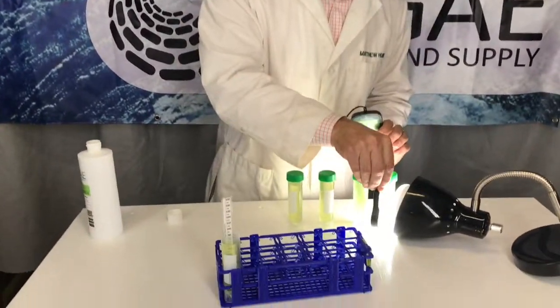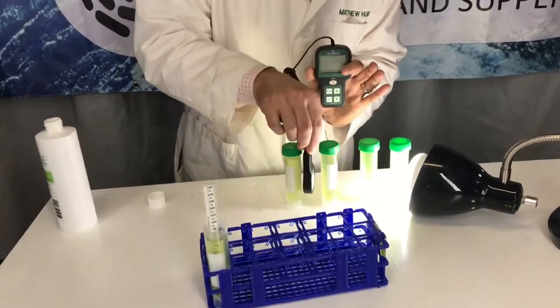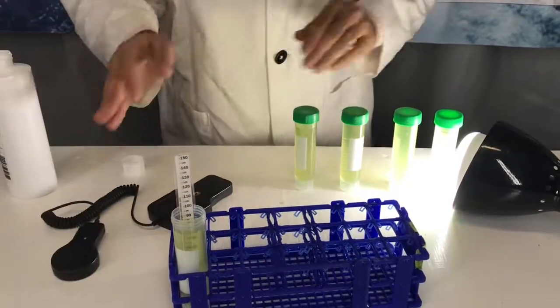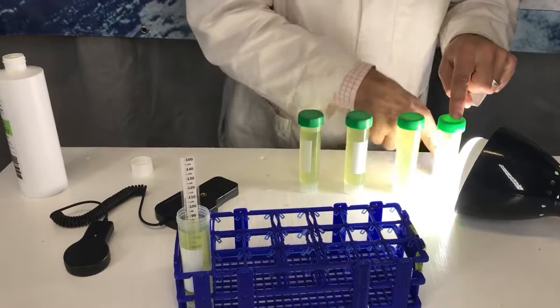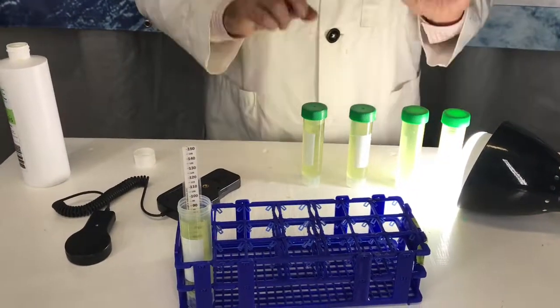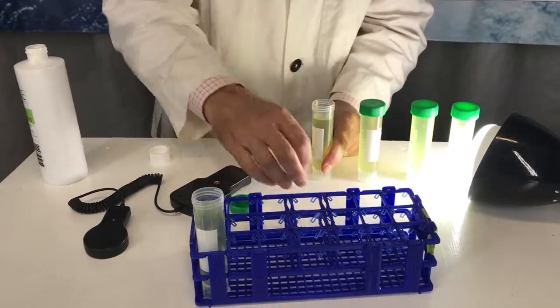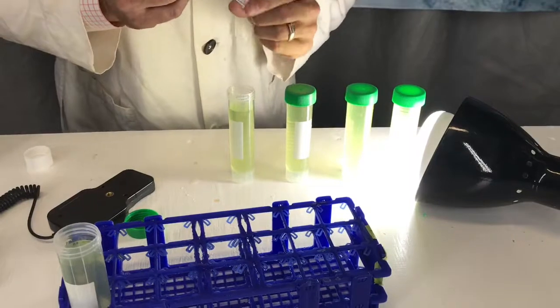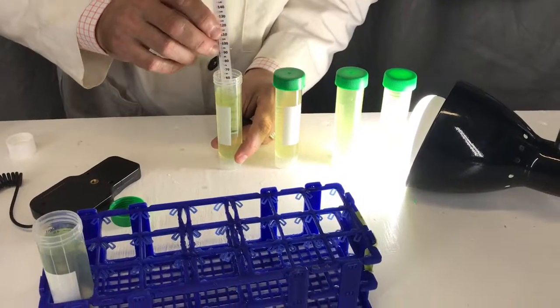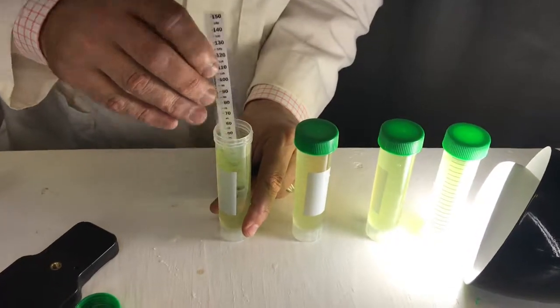With each one of these containers, you want to get a good estimate of how much light is actually hitting each one. If you lay a piece of paper down first, each student can write their name to mark where their container goes. Then you'll want to record everything — you've got to record the math.